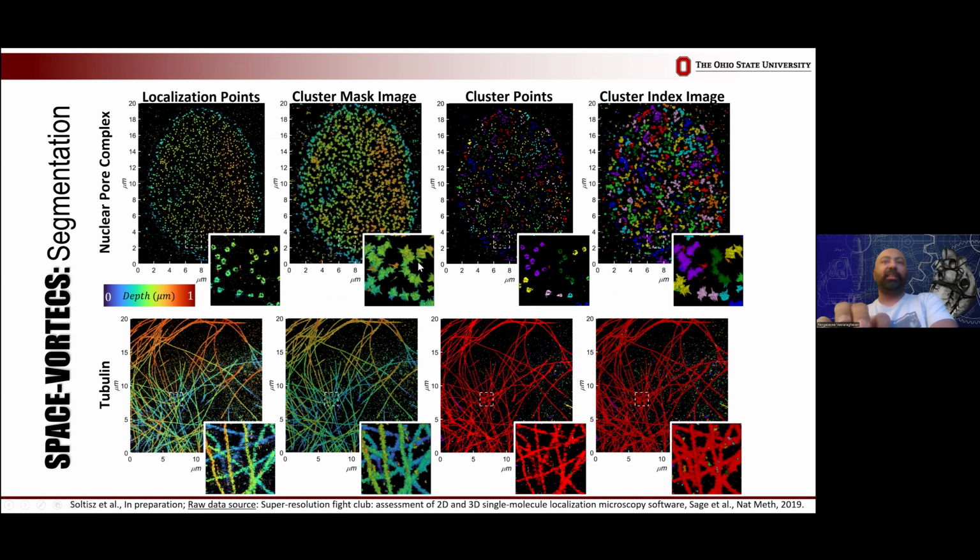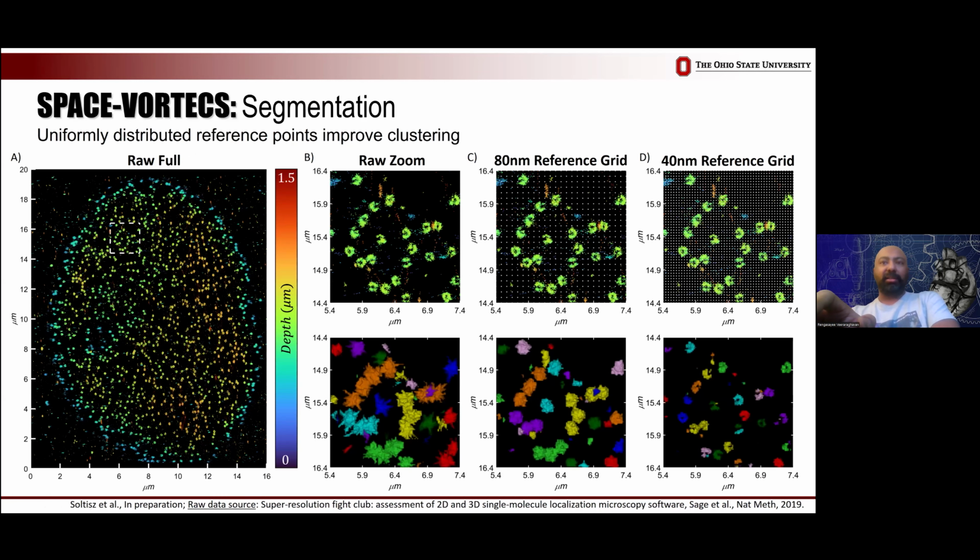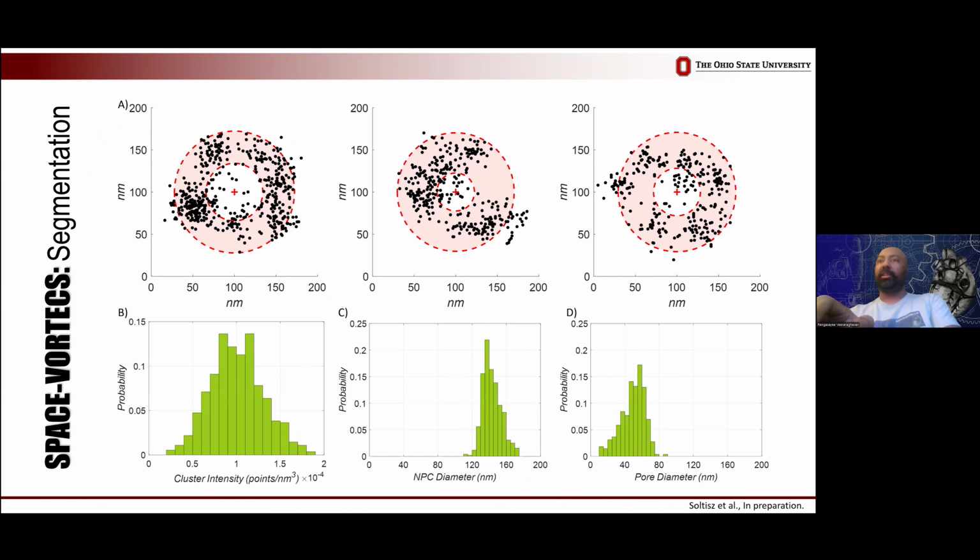I won't bore you with details, but with some minor modifications, we were able to do that as well, even measure the sizes of these structures, and they agreed with canonical methods. I will just say we weren't trying to build a segmentation tool. It accidentally worked out that it also does that. So be attentive to accidental benefits from what you're building.